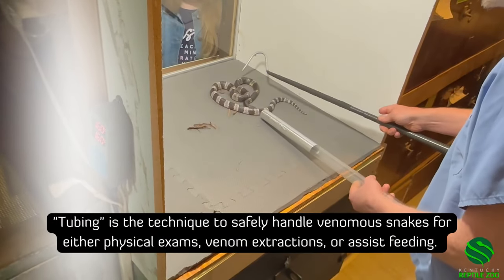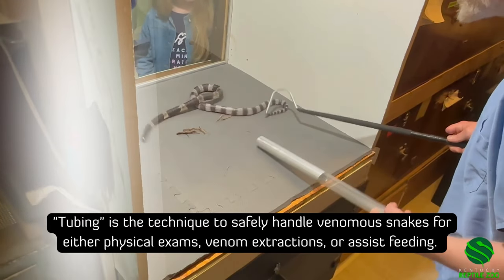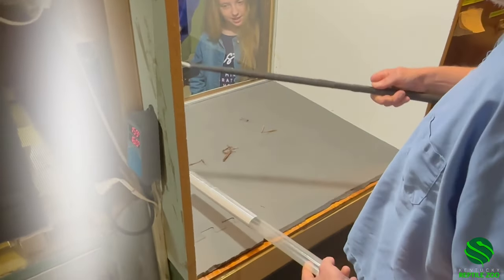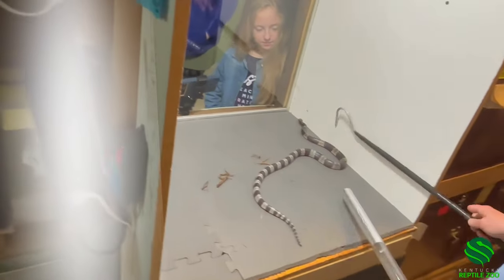I have a different technique for tubing these that I like. I lift them with the hook and then put the tube below them and almost like droop them into it — I have better luck with that.